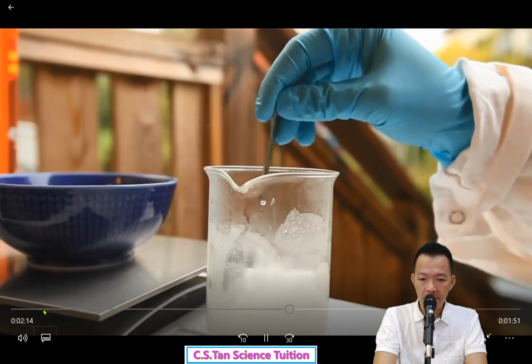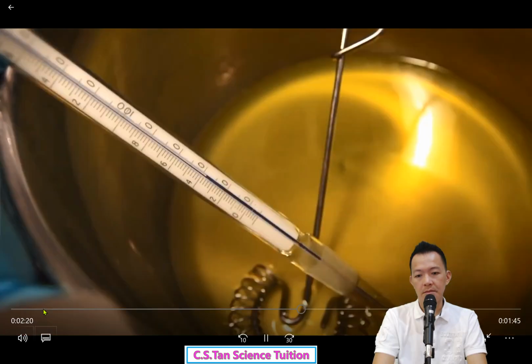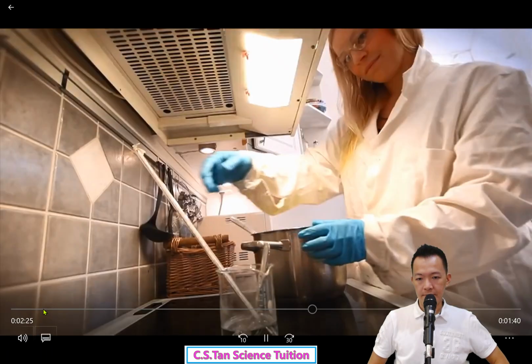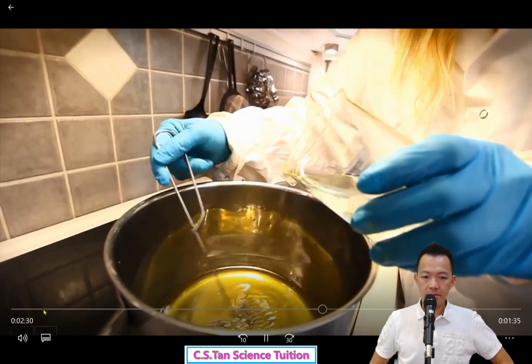So we want this warm solution to cool down a little bit before we mix it with the fats. In fact, we want both solutions to be at around 50 degrees Celsius, so we're heating up the fats while leaving the sodium hydroxide solution to cool. When the two solutions are both at 50 degrees Celsius, it's time to mix them.